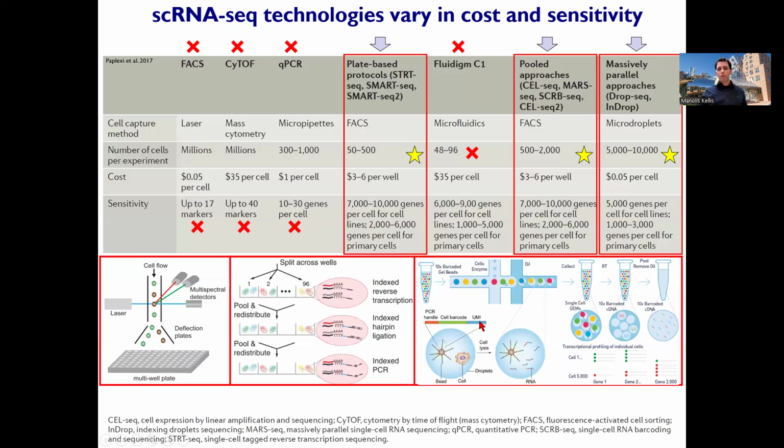And that's basically what we're going to say when we ask, how many cells did I capture? Well, that's the number of barcodes. How many unique RNA molecules? That's the UMI. Okay? Everybody with me here?